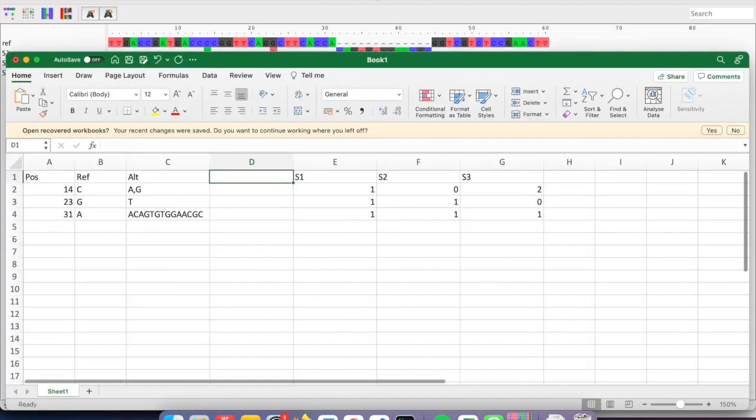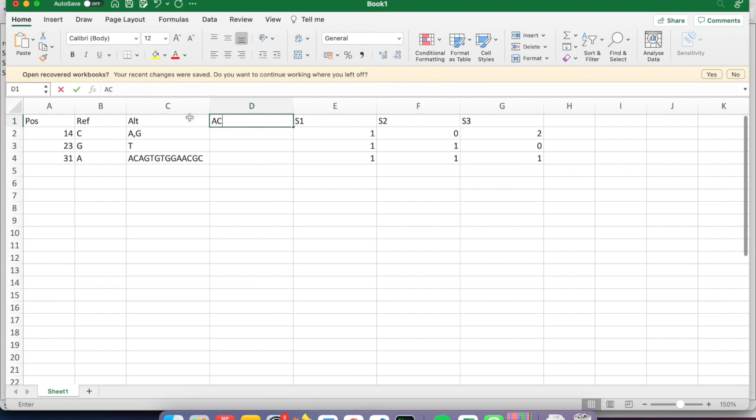So let's just make this a bit bigger. We can calculate the allele count. In this case, it will be just 2, because we have 2 alternate alleles here. Here again be 2, and here 3. So if we want to filter and only select those at which, actually let's flip it around.